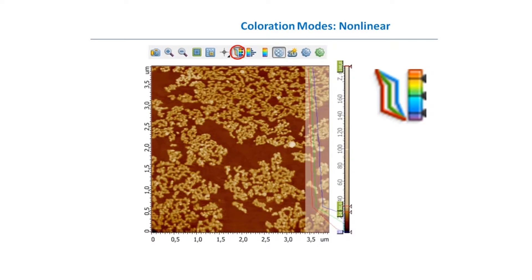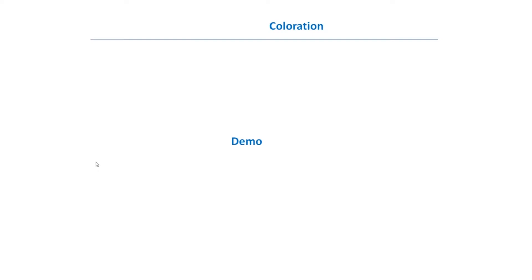The way I like most is the so-called nonlinear tool, where we can adjust our histogram and coloration nonlinearly. I will now show a live demonstration of how to do it.